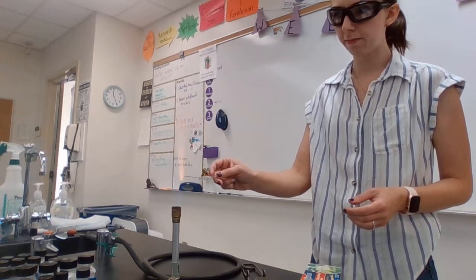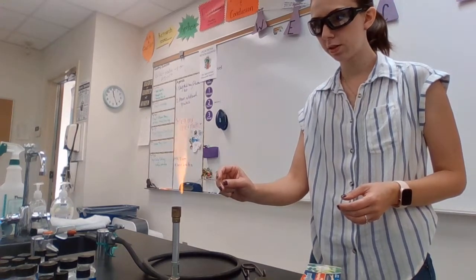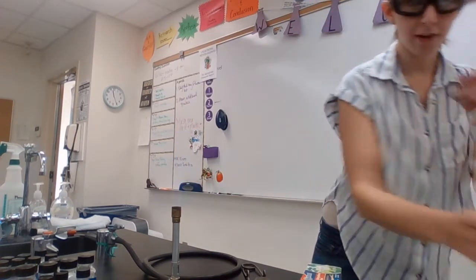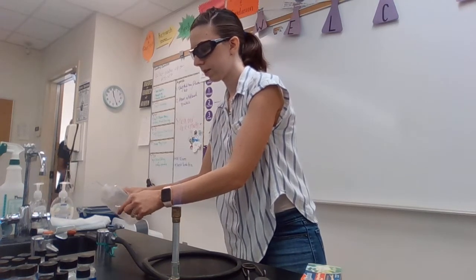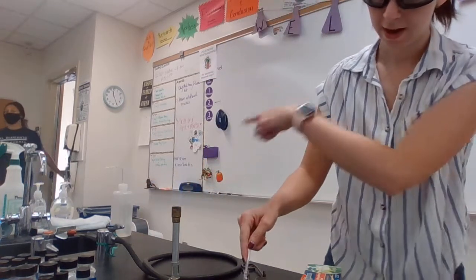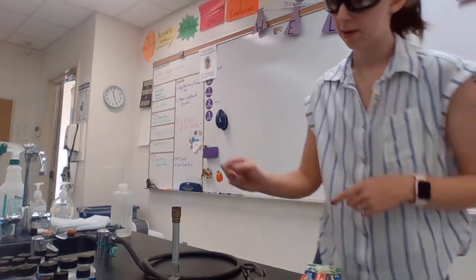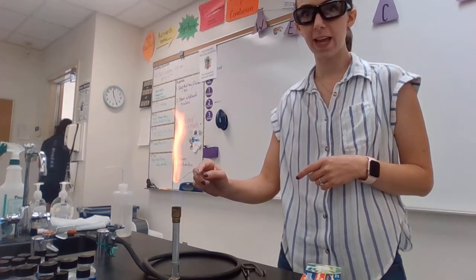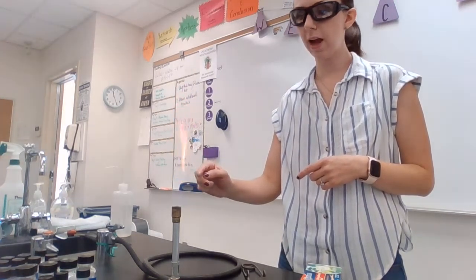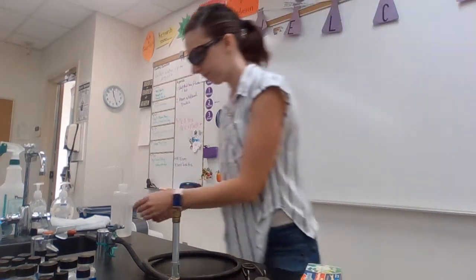Ooh, so we have like a red-orange color, now more of an orange. And we can rinse off our wire to make sure we get a true actual color. So it's rinsed off here. And we are going to test it in here. Try again. And we have a red flame again. So red color flame is bottle number 1, is red.